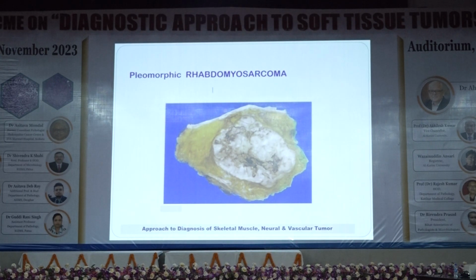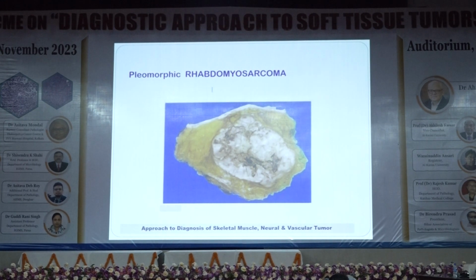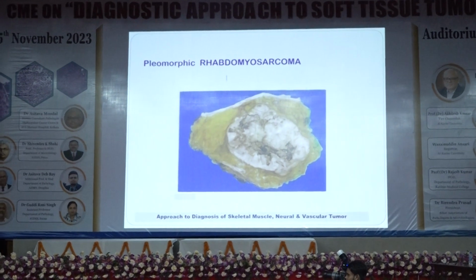This is a huge tumor. Grossing is very important. All reporting histopathologists must gross themselves, or at least in the medical colleges must see the bigger tissue, because sometimes the first year, second year postgraduates miss the section from the area that should be taken. Or at least if you have seen the gross, you can expect the finding, oh, this should have been malignant. How come this only shows necrosis or hemorrhage?